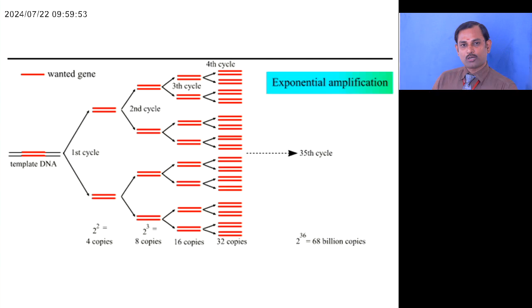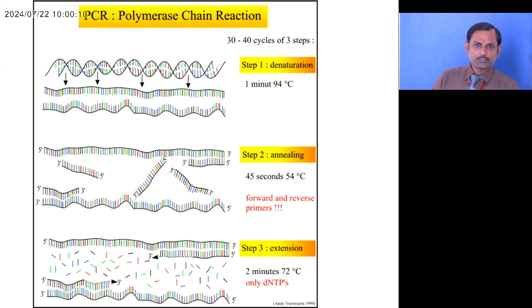The two copies again undergo the PCR technique and give you more copies. So finally it will give you a large number of DNA copies. This is the reason why we need the PCR technique. This shows how the DNA is continuously multiplying in the PCR machine.